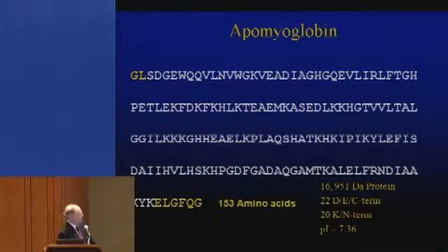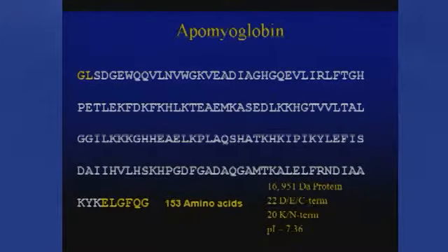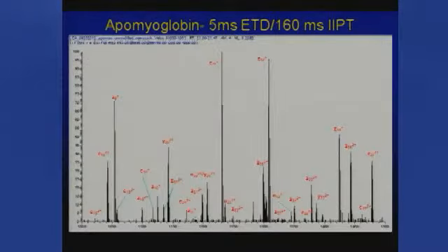So the reason you don't see the Z's 1, 2, 3, 4, 5, and 6 is because these residues are not basic, and we don't see the first 2 amino acids up here because their mass adds up to something that can't be transported down to the C-trap under the conditions we're running the spectrum. Okay. So now, keep going.